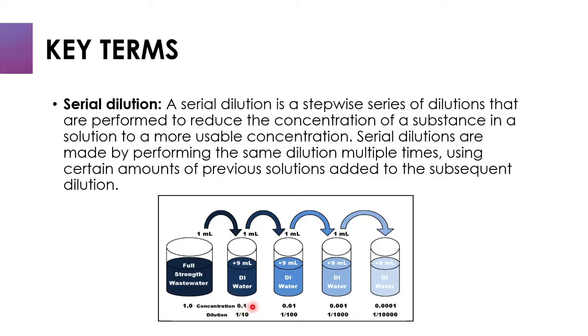After that, we dilute the 0.1 molar to 0.01 molar, and the 0.01 molar to 0.001 molar, before diluting it to the final concentration.